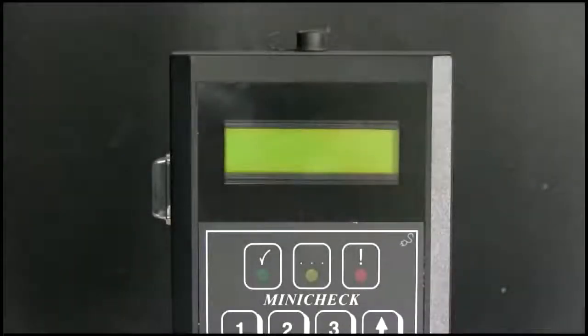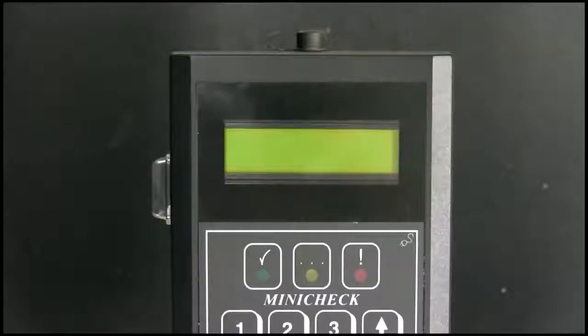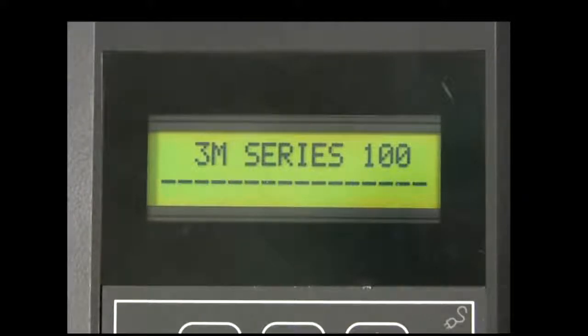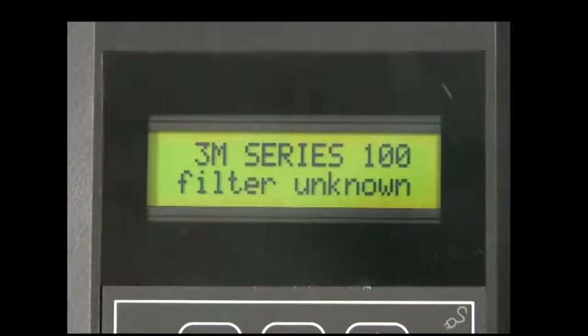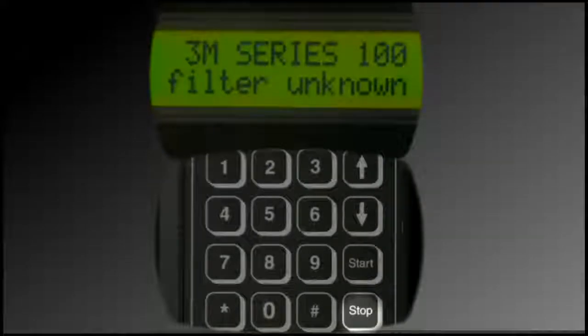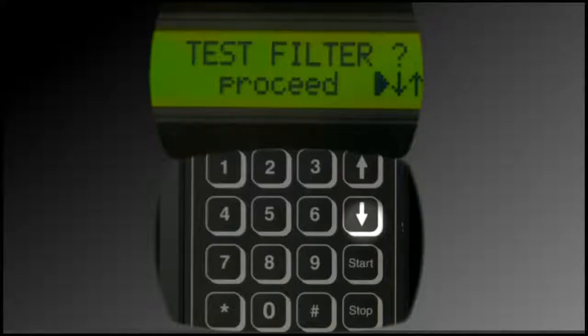To access the service menu, first activate the device by pressing the on button. A series of messages displays including the latest version information. It will then note the last test program used or display the message "Filter Unknown." Press Stop on the device keypad, followed by the down arrow until Service displays on the screen.